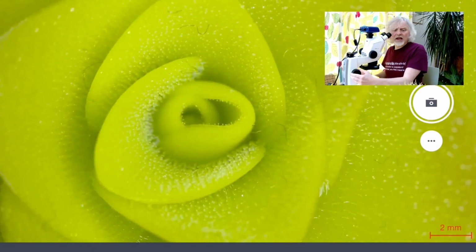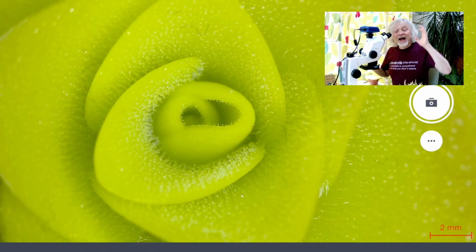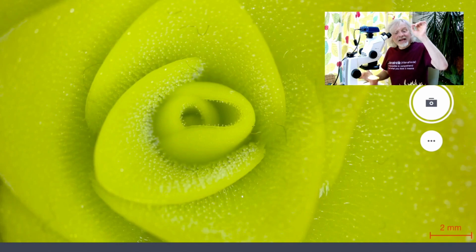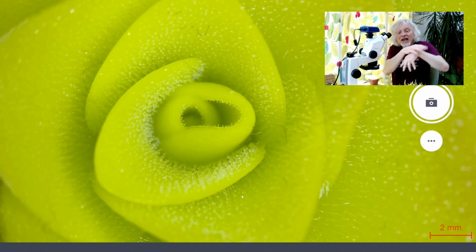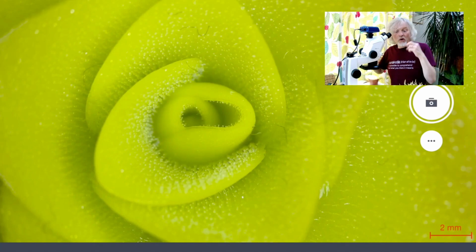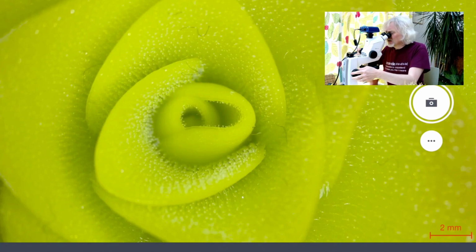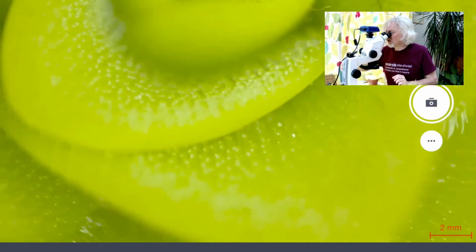And can you now see the whole surface of this plant is, again, covered in tiny, tiny little droplets. And each one of those is on a little stick with a ball at the end, and it's exactly the same as the Drosera. It doesn't do the thing where it kind of moves its bits to engulf the insects. What happens is insects will just literally land on this and wriggle around, get caught. And obviously they're very small insects.